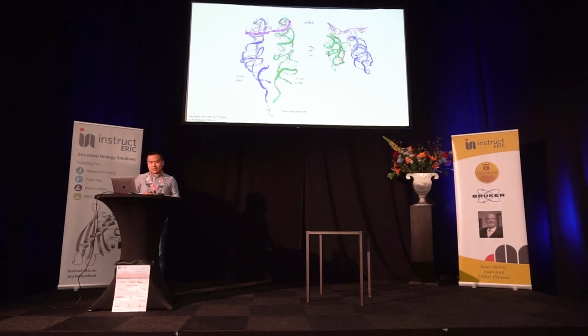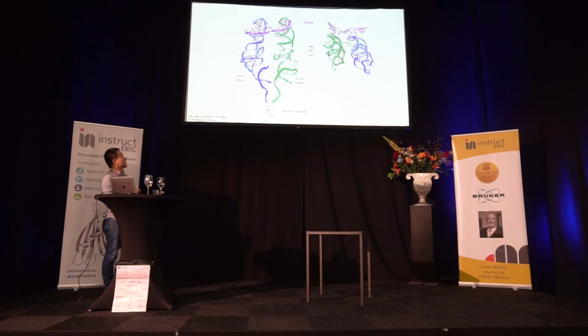And here also is in the major class, as you can see, for the most important mRNAs and also A and P site tRNAs and also the nascent peptide chains. Actually, we can directly see this density inside cells.